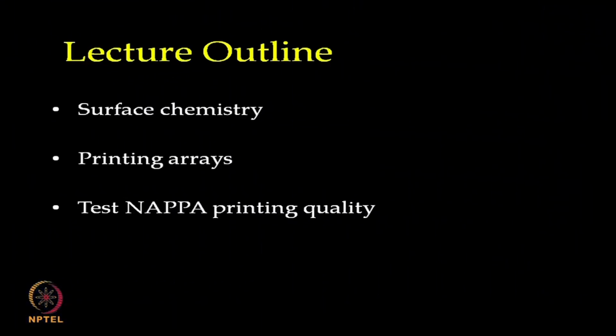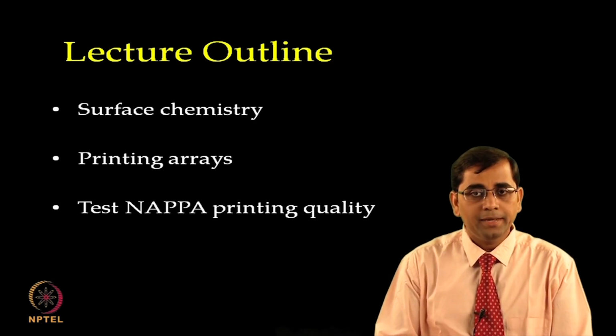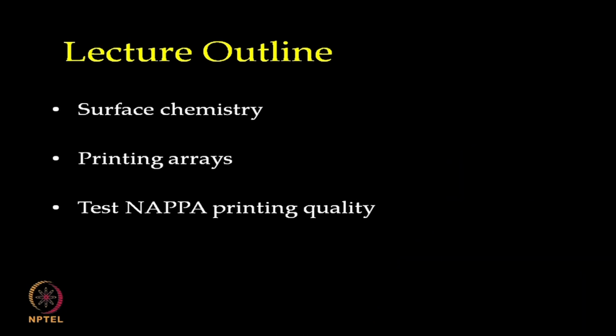Welcome to MOOC Interactomics course. In our previous lecture, we discussed the general workflow of NAPPA, focusing on plasmid DNA extraction. In today's lecture, we will speak about the subsequent steps involved in performing NAPPA based experiments, including surface chemistry, printing, quality control checks and protein expression.